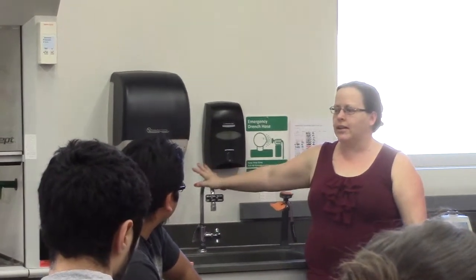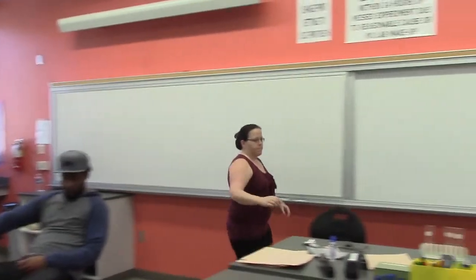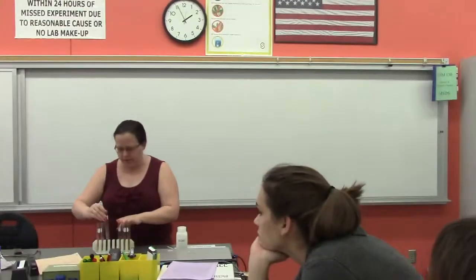But when you're done cleaning, everything gets a final rinse with distilled water. We always want to rinse off any tap water because we don't want that interfering. And in this particular lab, tap water residue will create problems with some of the reactions we're trying to observe. So you wash in the tap water, then you go over to the sink with the distilled water tap, rinse everything one more time, okay? All right, so now we're ready to do the second part.